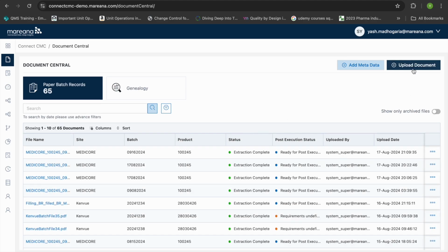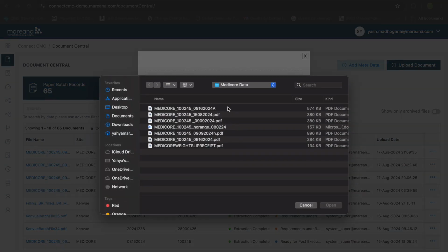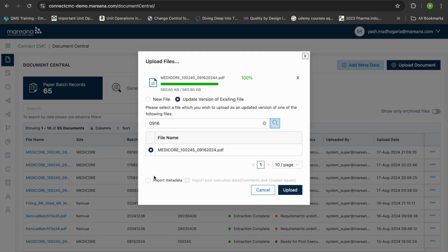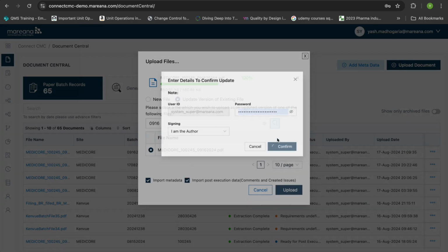I'm going to upload a new document with all of the old metadata that was on the document, but it would be compiled with the updated document. So everything that was already a system verified pass will stay, and everything else that I've manually approved will stay. The only thing that will be new is the new operator information.